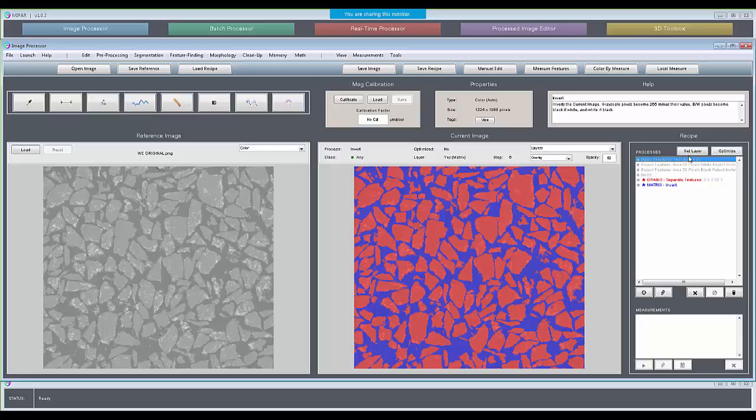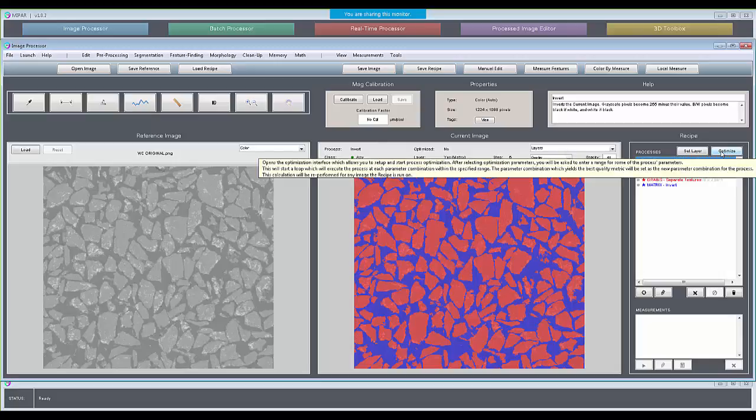The optimizable steps, just as a heads up, are listed in the optimization section of the user manual. They include many of the common ones like thresholding and reject features. Well, I guess not reject features, but thresholding for sure. And what it does is it lets you say, I'm not sure what the parameter should be.